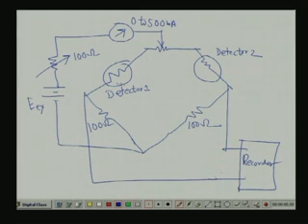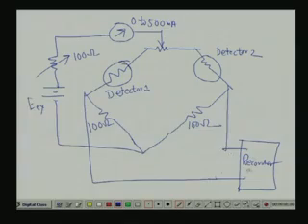So, whenever the eluting peak comes, that means when the gas is coming out, detector output will change, because there is a thermal conductivity difference there. So, automatically if it changes, I will get an unbalanced voltage that will be recorded in the recorder, right. Now, again you see, for high sensitivity analysis of organic compounds, the hydrogen flame ionization detector is used. That is a different thing. Okay, we will discuss that also. So, two detectors are used. You see, we can have 4 detectors also, 4 detectors in one block itself, right. It looks like this. You see.